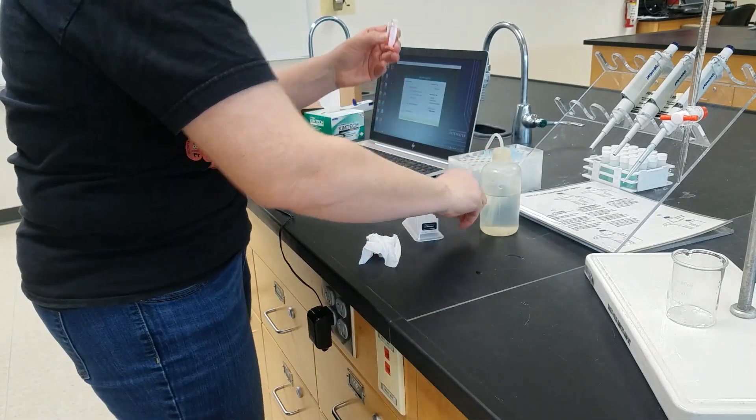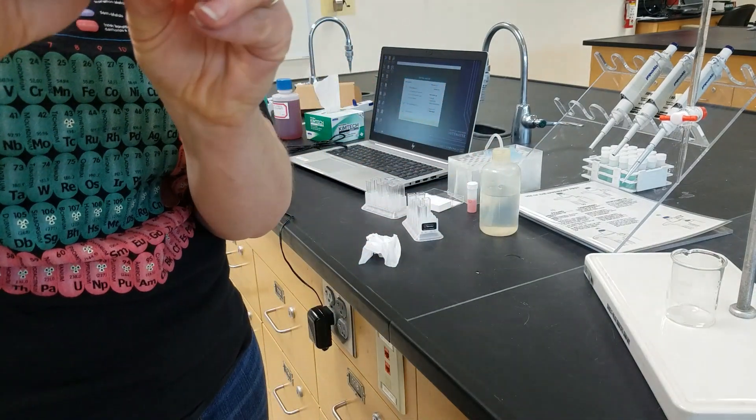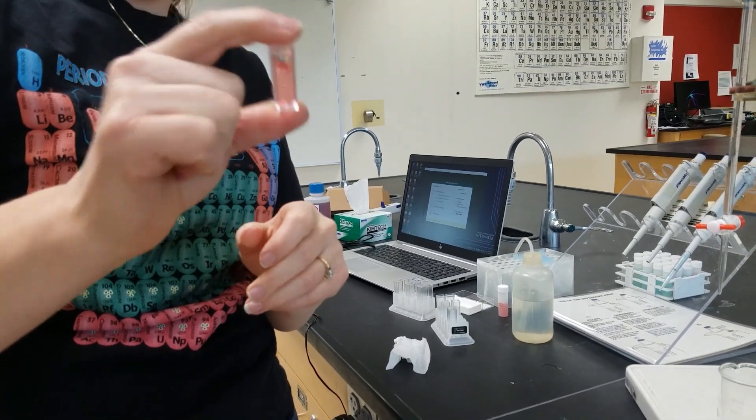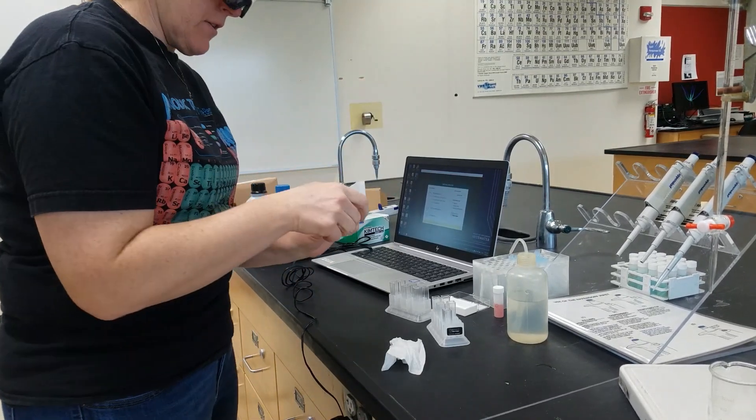We want to make sure that is mixed thoroughly because the top is less diluted than the bottom at this point. So I put a cap on and shake up our unknown.